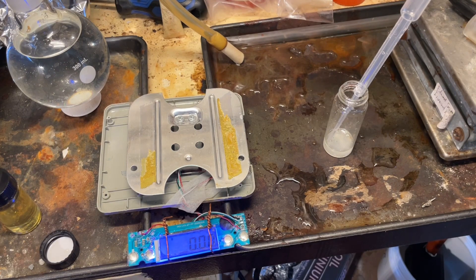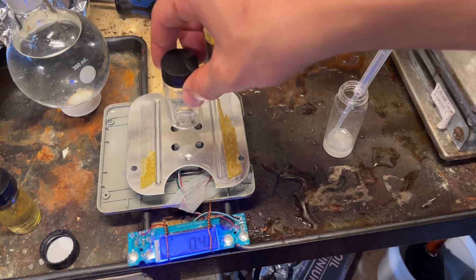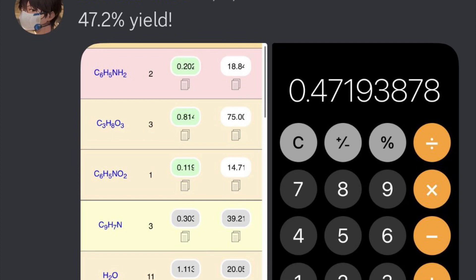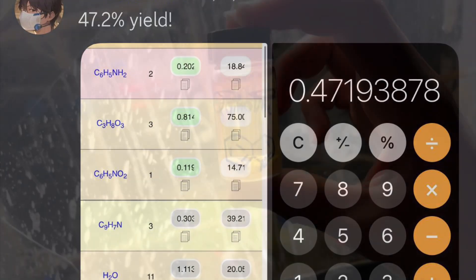I decided to measure yield, but the scale broke. For some reason I don't know why, so I smashed it with a hammer because I got mad at it. But I got approximately 47% yield.